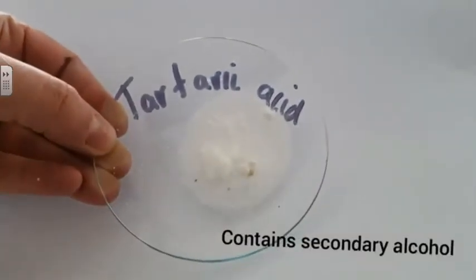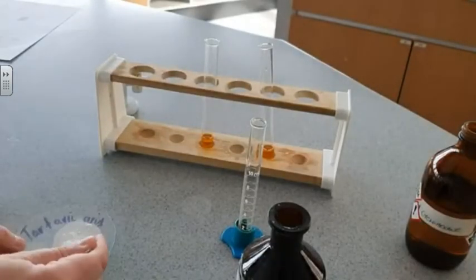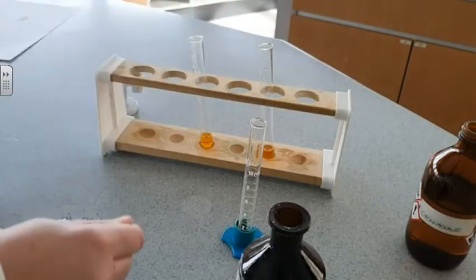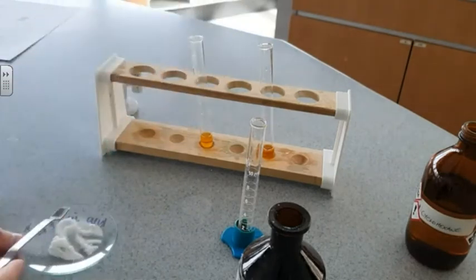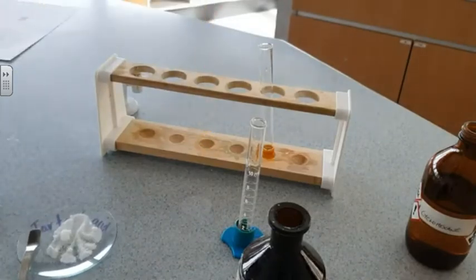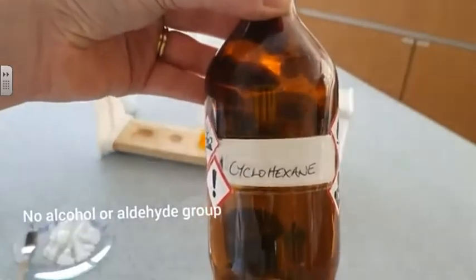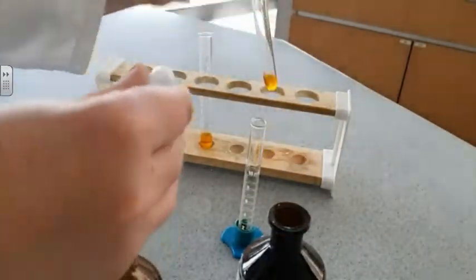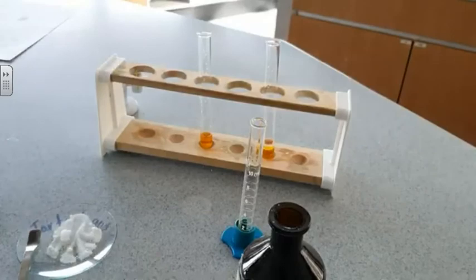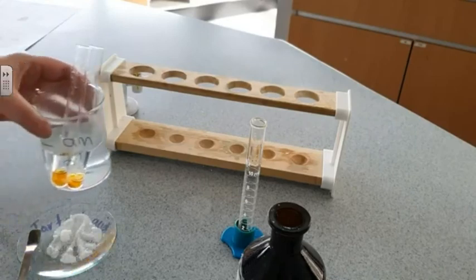So what we've got here is tartaric acid. Tartaric acid contains a secondary alcohol group. A small amount of tartaric acid in with the acidified potassium dichromate. And again we're going to use cyclohexane, which is a cyclic alkane and doesn't have these functional groups for the negative test. So we've got two things there, one with our tartaric acid, the secondary alcohol, and one without.